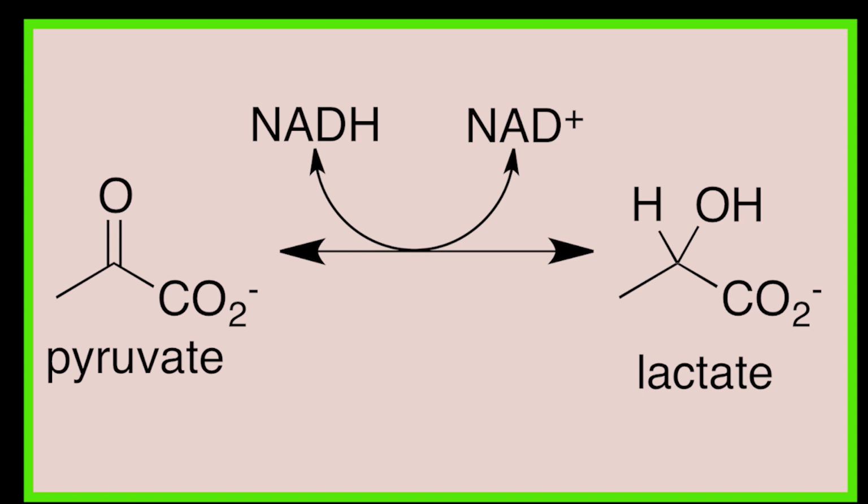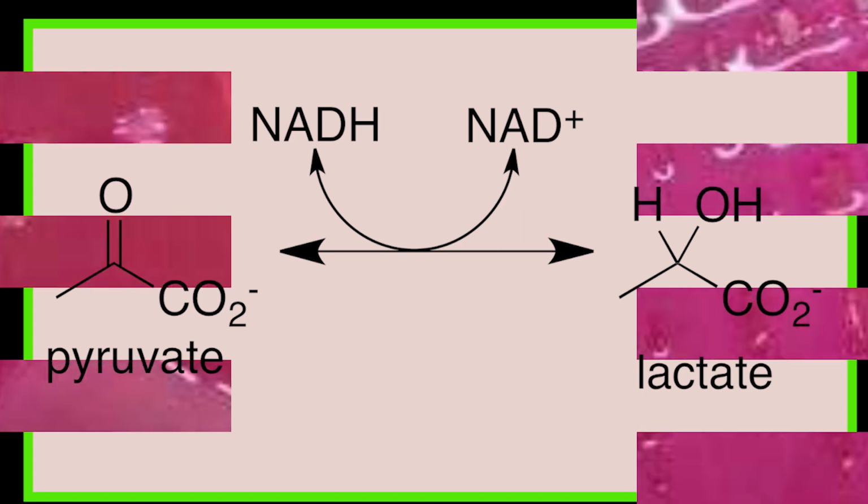The lactose present in the MacConkey agar is taken up by lactose fermenting bacteria by lactose permease and fermented. The end product, lactic acid, is excreted by the bacteria and changes the pH to acidic. The original pH of the media is 7.1 when prepared. Now the pH is lowered by the lactose fermentation.